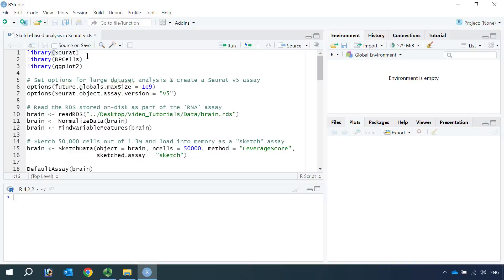Hi everyone. Welcome back to my short video tutorial for single-cell RNA sequencing data analysis. In this video, I'm going to show you how to use the sketch-based workflow and analyze a 1.3 million cell dataset for the developing mouse brain.